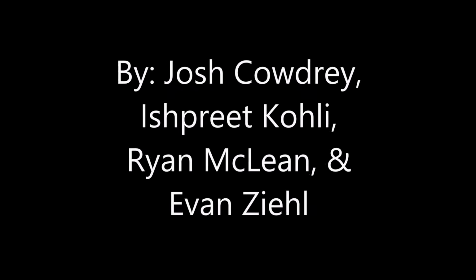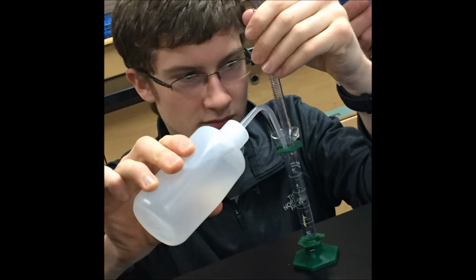Crystal Violet Kinetics Lab by Josh Cowdrey, Ishpreet Kohli, Ryan McLean, and Evan Ziehl. Here is a brief description of our procedure.